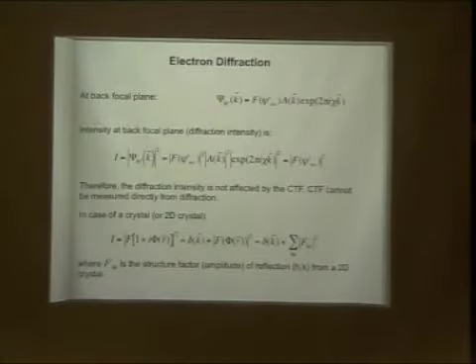So what this tells you is that even though you have this CTF in there, in the diffraction plane you don't see all this. So this also means that you cannot actually measure the CTF by diffraction. People ask this question, right? The student asks: if measuring the CTF is so complicated, why can't you just do a diffraction and measure it there? But it turns out that it doesn't work this way.